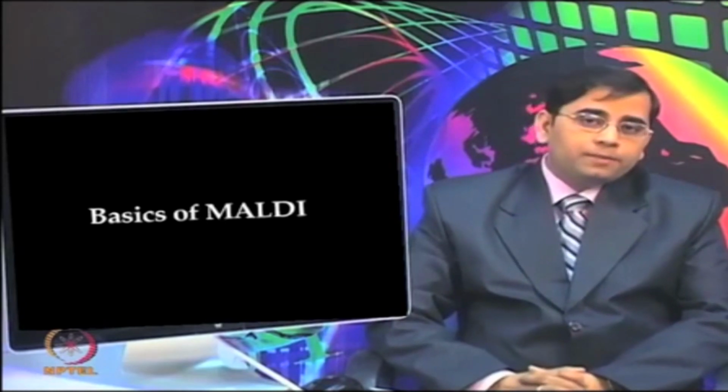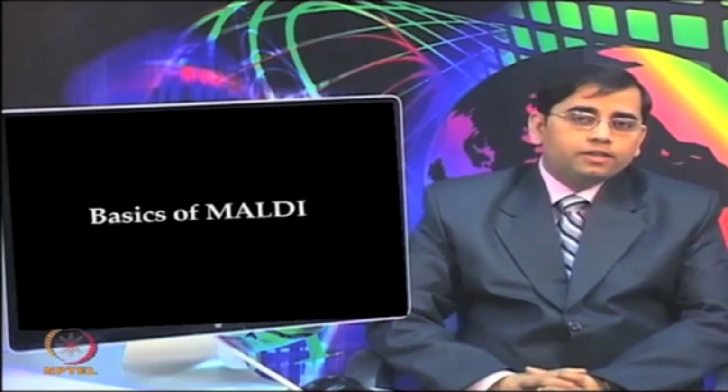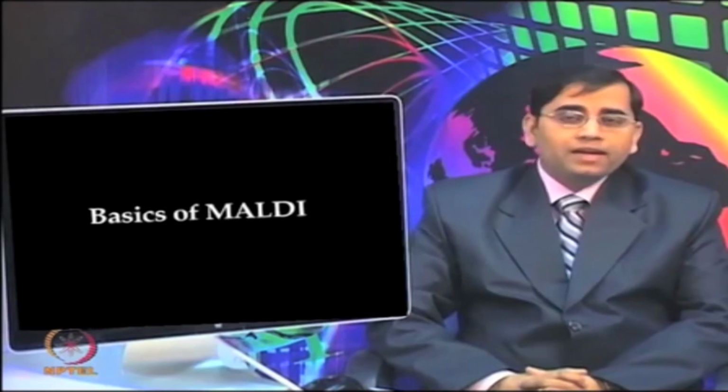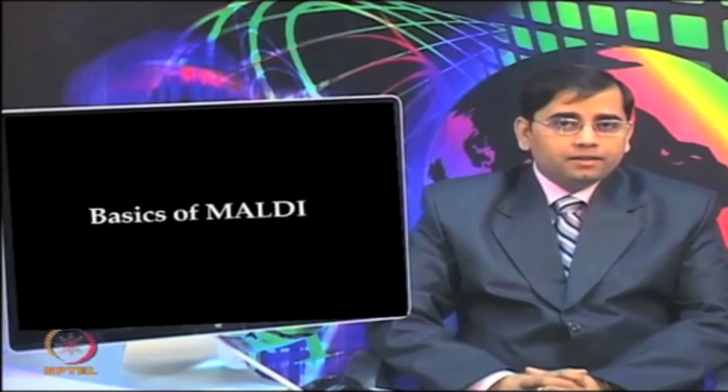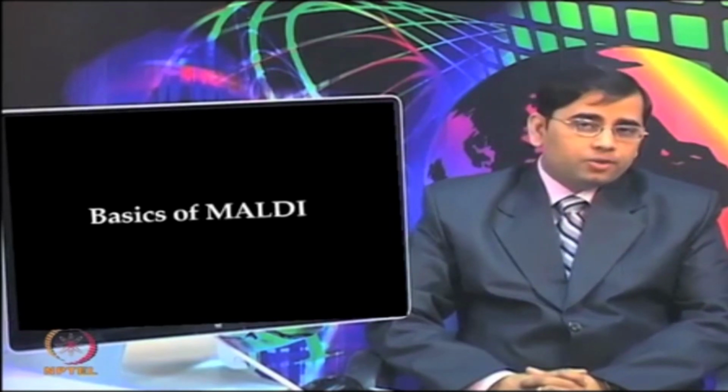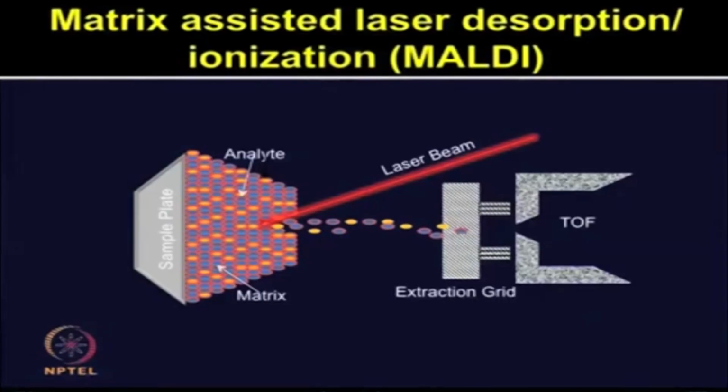So, let us go through some of the basic concepts involved in MALDI-TOF. We can split that in two parts. One is MALDI, which is the ionization source, and the other is TOF, which is a mass analyzer. Let us first talk about matrix assisted laser desorption ionization or MALDI.